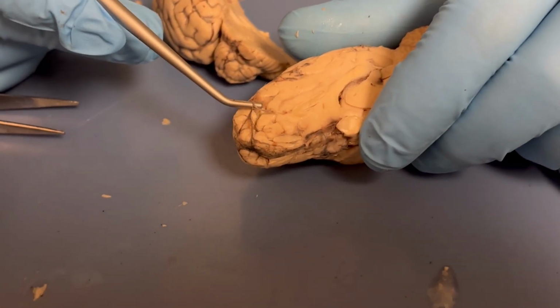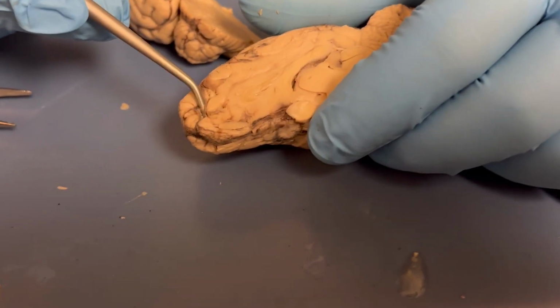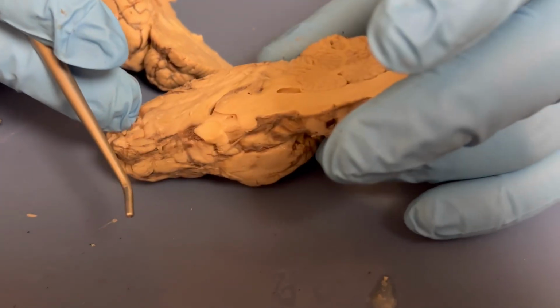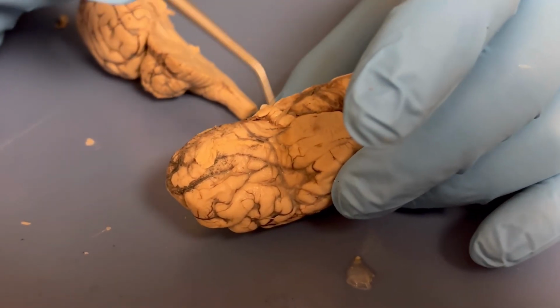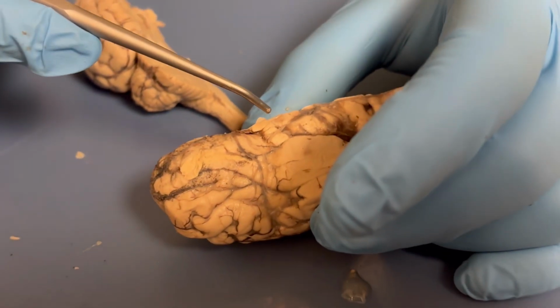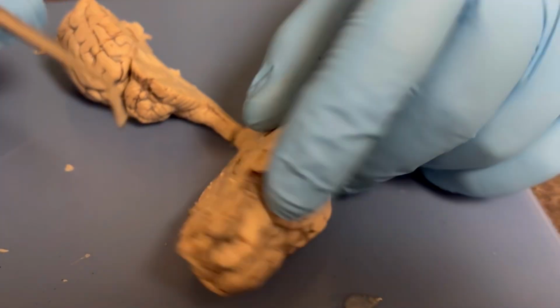The olfactory bulb is located on the anterior part of the brain, and it isn't very present here, but it processes information related to our sense of smell. Then we have the optic chiasma, and it's very difficult to see, but it would be located on the bottom of the brain near the middle, and it contains optic nerves that make a little X across the middle, but those nerves were removed before dissection, making it difficult to see. But it allows for the process of vision and relay of information from the eyes to brain.